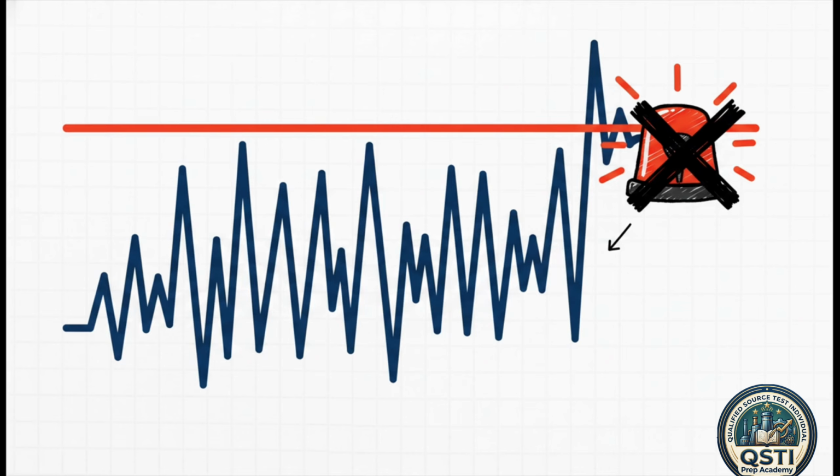Your calibration span is the upper limit of your analyzer's calibration, which is set by your high-level calibration gas. If your average emission readings spike higher than that high-level gas, boom, that run is instantly invalid. You just cannot report data that falls outside the bracket of what you've actively proven your machine can accurately measure. You'd have to recalibrate with a higher span gas and do the whole run all over again.